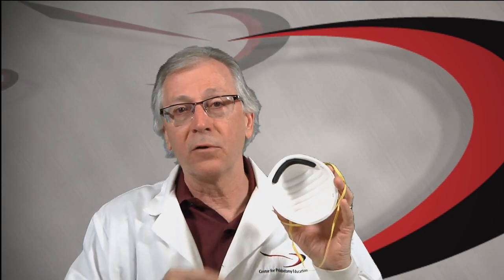You're not immortal. So let's talk about masks. This is the infamous N95 mask. It's called N95 because when it's properly fitted, they block at least 95% of very small particles. They're designed to achieve a very close facial fit and very efficient filtration of airborne particles. Note that the edges of the respirator are designed to form a seal around the nose and mouth. N95 masks are ideal if you have them and are most certainly required when you're engaging known COVID-19 positive patients and patients with their symptoms, which are fever, cough, and shortness of breath.